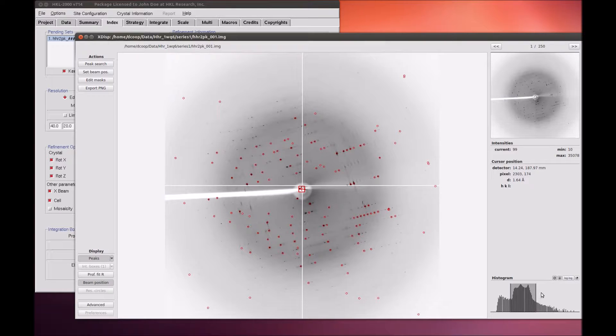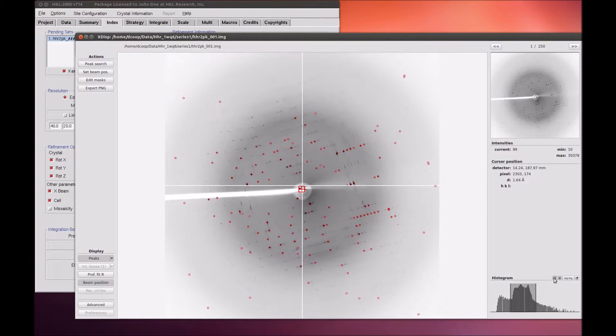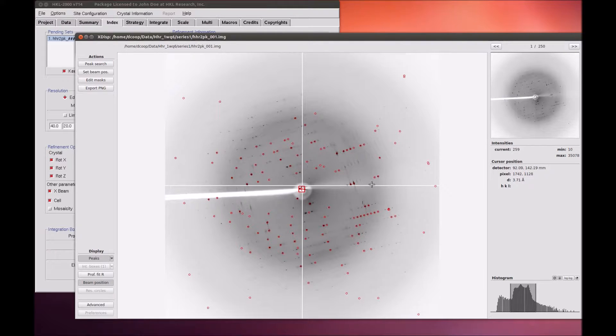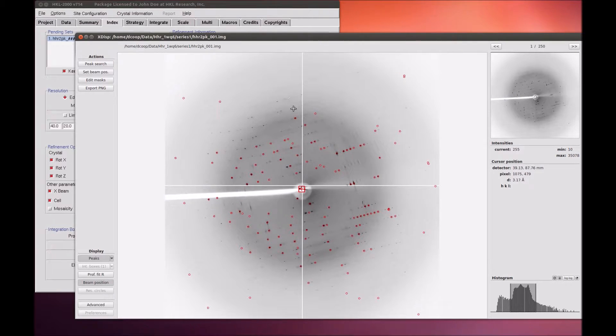If your screen update is too slow, turn off the automatic refresh button. The minimum and maximum intensities for the image are displayed on the right side of the display. The cursor position, intensity at the cursor, and the resolution at the cursor are also displayed when the cursor is in the main window.